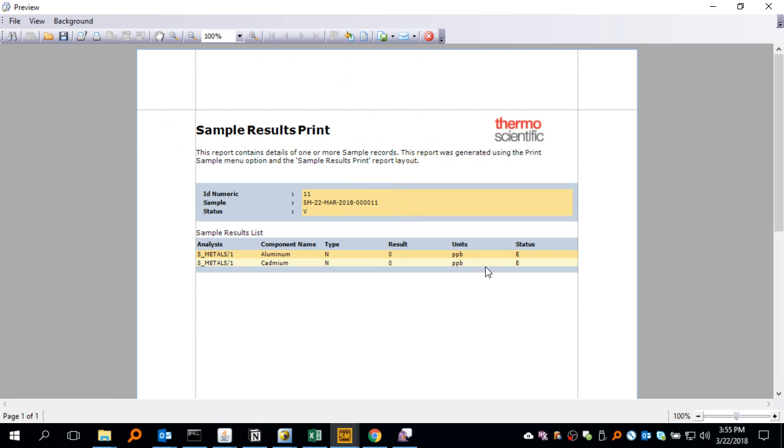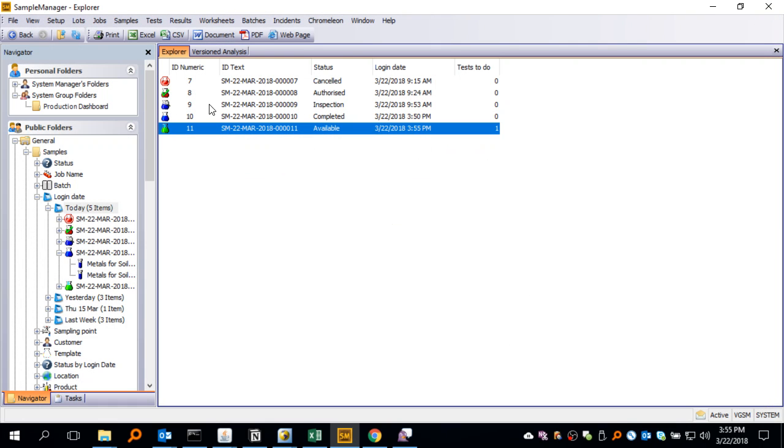the sample report, and this is true for any reports, you'll see that the records actually exist and they show up on the report, but only for two of them. The others, it's as though they aren't entered. If you ever have a customer who's asking, hey, I'd like to have the others show up, but just with a blank for the result, then what they may be looking for is for you to implement component lists.